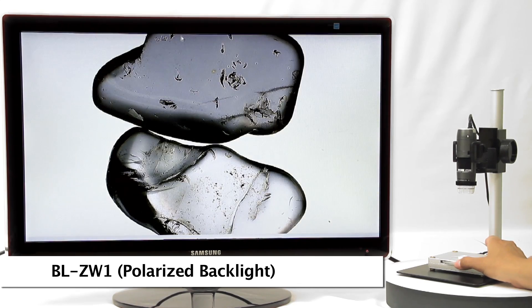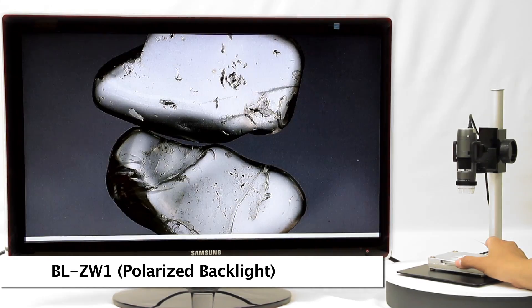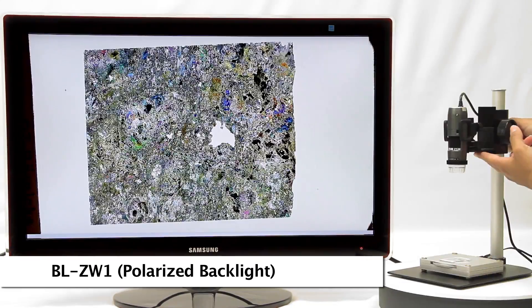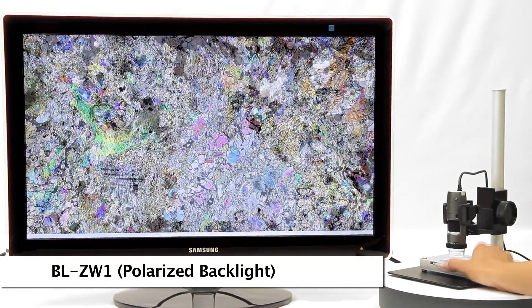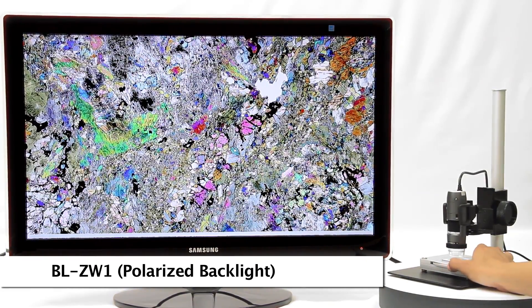The BLZW1 is a polarizing backlight stage. This model can be paired with a polarizing Dynolite microscope for easy cross-polarization microscopy.